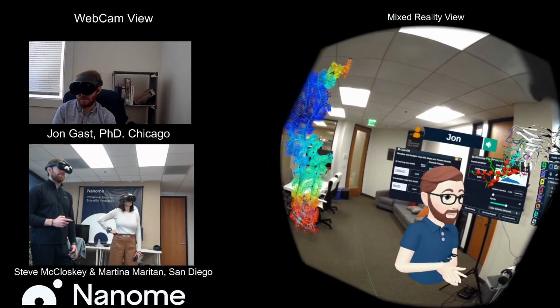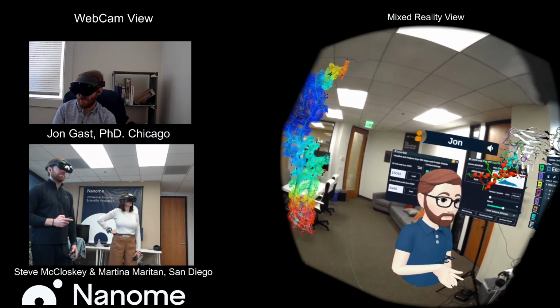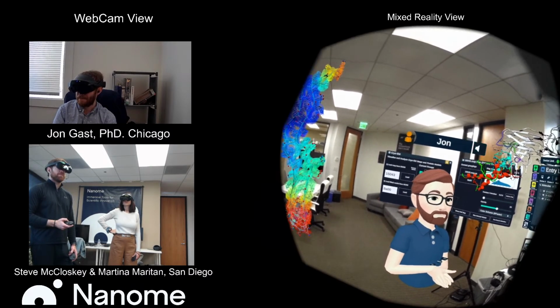So I would say definitely try it out. And if you find a limitation, let us know. More often than not, we can give you some idea about the compute range. That would be helpful.